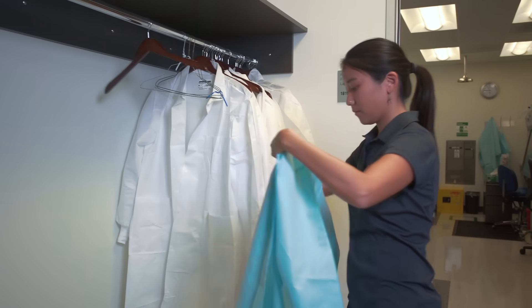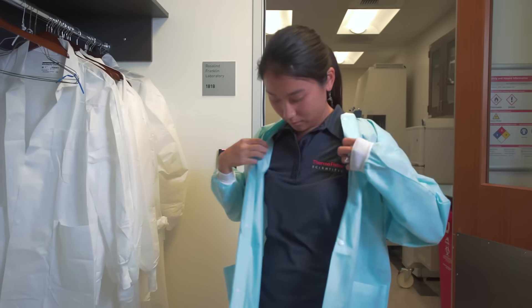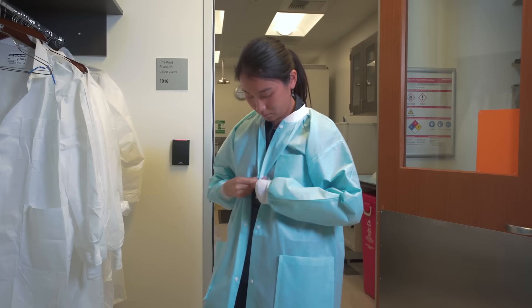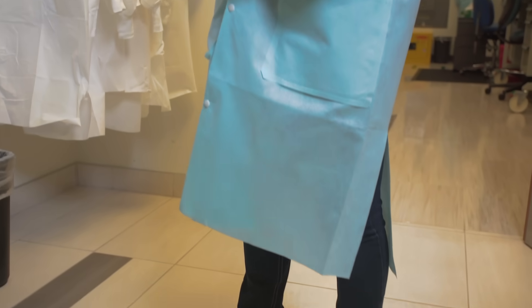Always wear basic personal protective equipment, or PPE, when working in the laboratory. Talk to the safety team at your institute for your required PPE. Also, remember to review the MSDS information before working with any media or reagents.